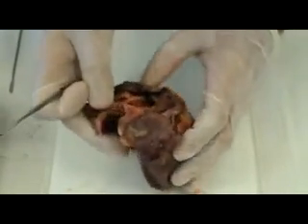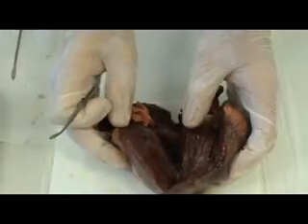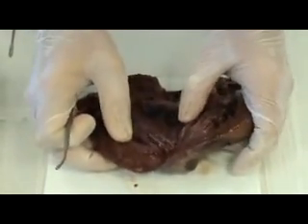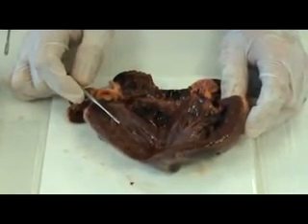So please have a look at all the views of the heart, and see if you can identify the various blood vessels and the chambers of the heart as well. Make sure you're also able to label the heart and follow through the various sections in your dissection books. This concludes the dissection of the heart.